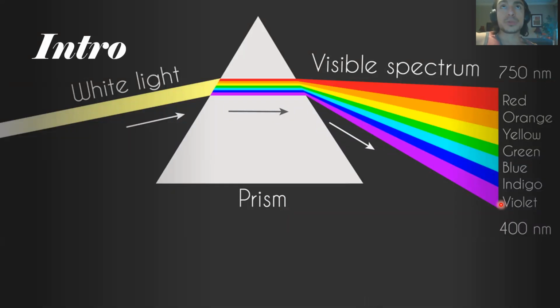So in visible spectrophotometry, the greater the concentration of absorbing ions or molecules in solution, the greater the absorption of visible electromagnetic radiation. The absorption or transmission of a certain substance can be determined by the observed color.